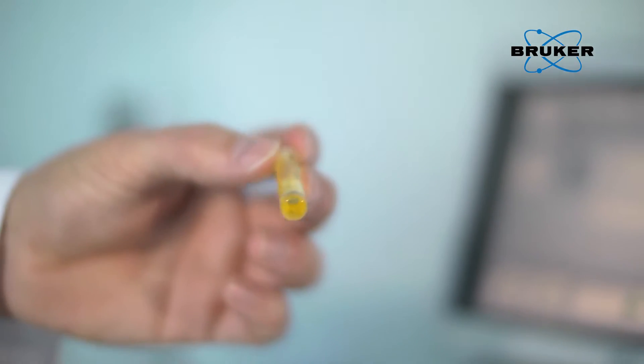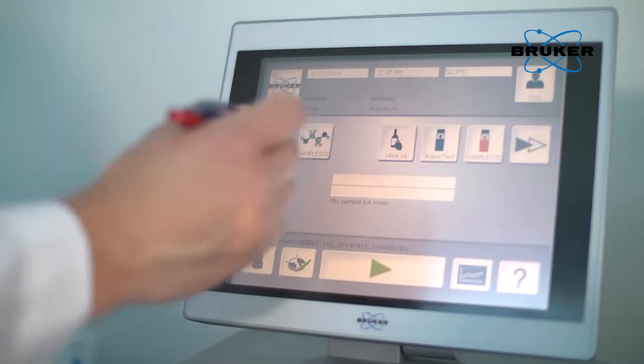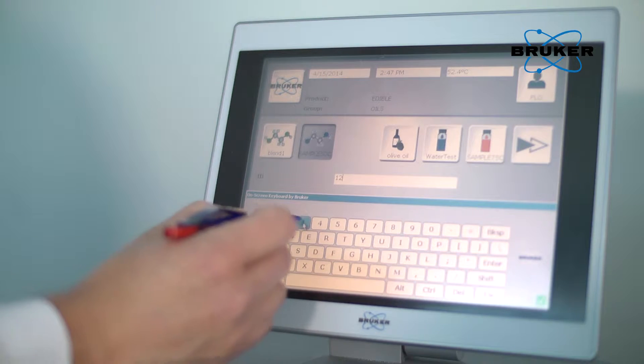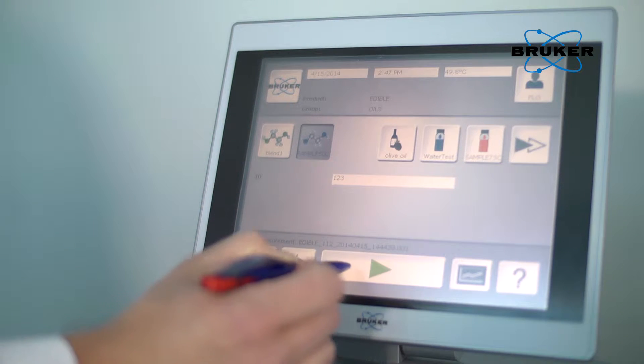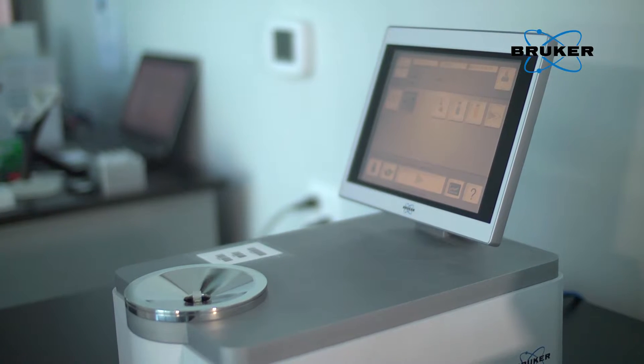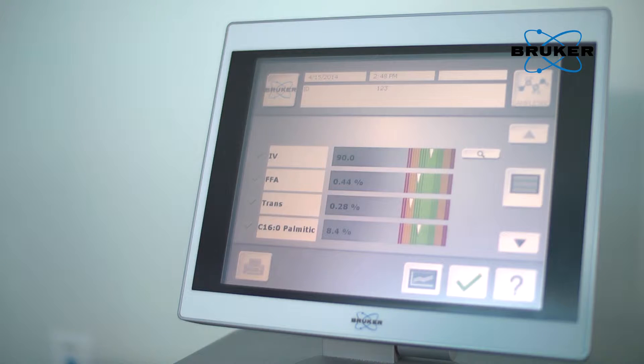The sample is simply filled into the measurement cup or sample vial and placed onto the spectrometer. The product is selected by either pressing on the respective product icon or by using a barcode reader. A simple touch on the screen starts the measurement. The progress is displayed through the green status bar. After approximately 15 to 30 seconds, the measurement is complete.